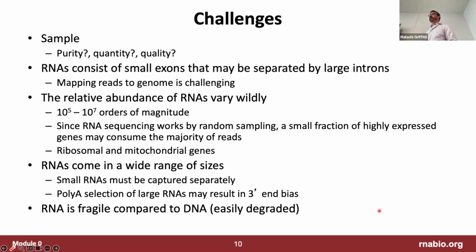And a lot of transcriptome experiments are hypothesis generating exercises where you often go on to the protein stage and then switch to other kinds of assays that are lower throughput, but actually do give you a readout at the protein level.